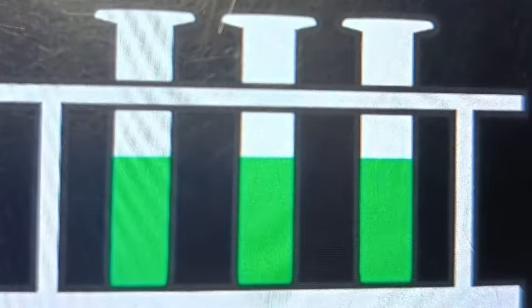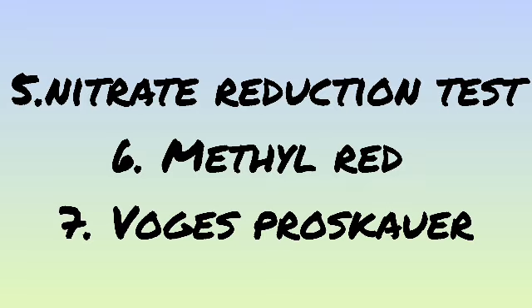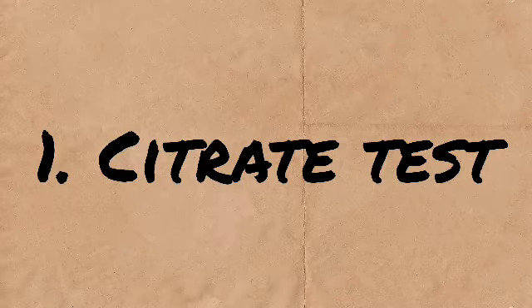The biochemical tests which I am going to discuss today are Citrate, TSI or triple sugar iron agar, motility test, urease test, nitrate reduction test, Methyl Red and Voges Proskauer test. Let's start with the citrate test.